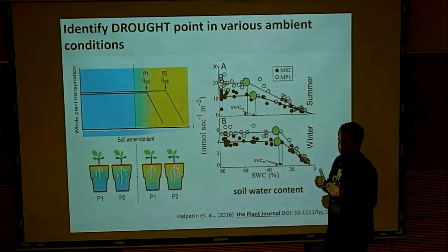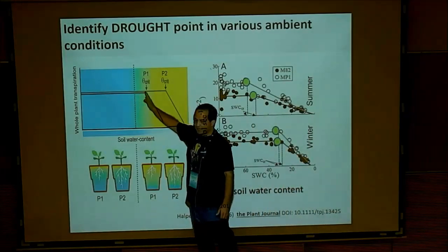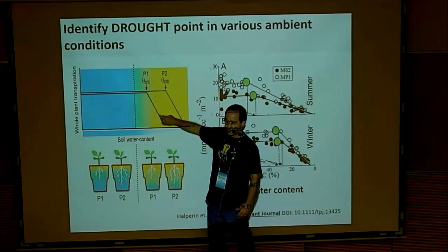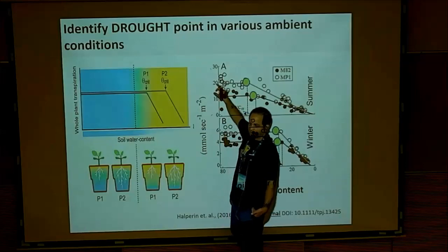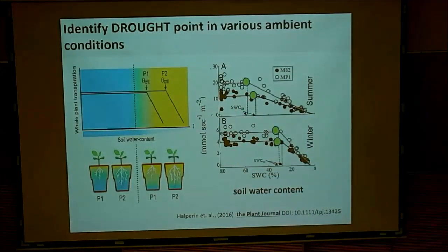It was very hard to do before this. So we usually extract RNA before the stress, at the theta-crit, and during the stress randomly. I mean, you can do 50%, and then you leave it a few days under severe stress, and in the recovery. It's just a suggestion. You can pick your own point.